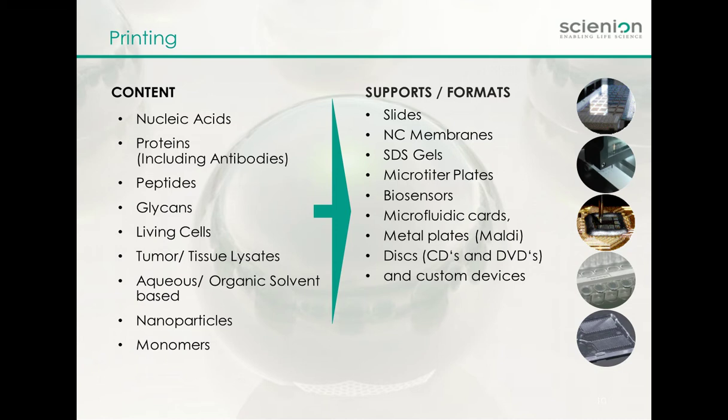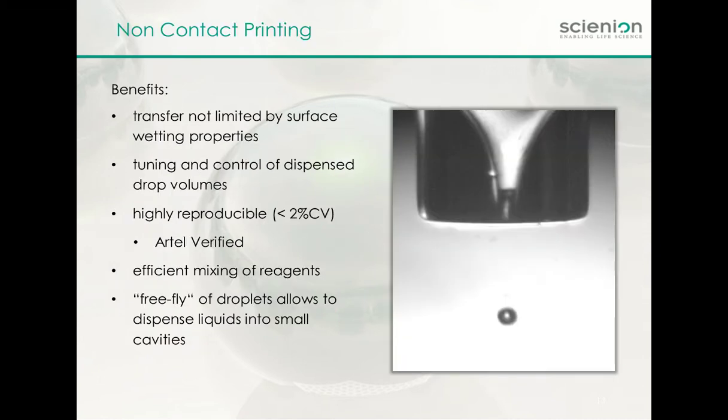With the technology as well, you can dispense to any type of support. So if you're doing nitrocellulose membranes or a slide or a microtiter plate or even a wafer, because the dispensing is non-contact, it's very much what we call an open platform.